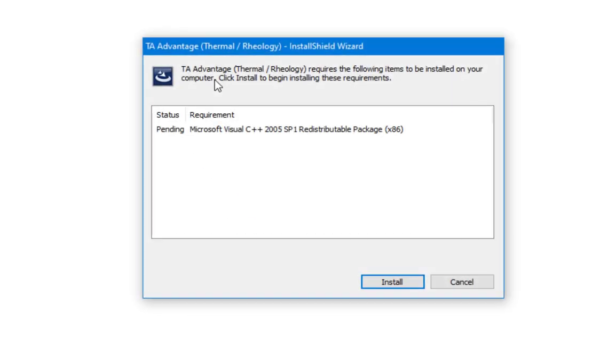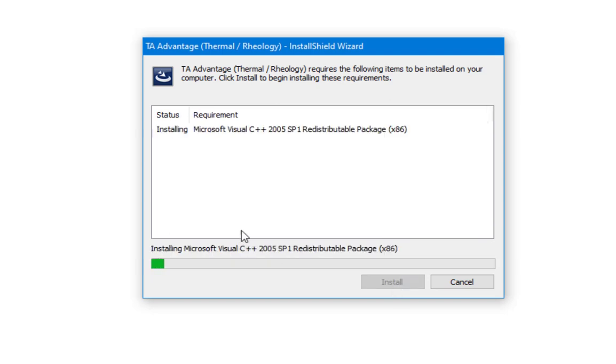All right, once this is downloaded, we're going to run the installer. It may ask for administrative privileges. You will need to have admin, so you can't install this on school PCs because you likely don't have administrative privileges, but you can install this on your personal PCs. It's free. A lot of school PCs, the lab ones especially, the computer labs in the science buildings, usually have this already installed.